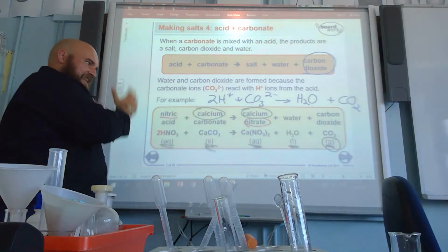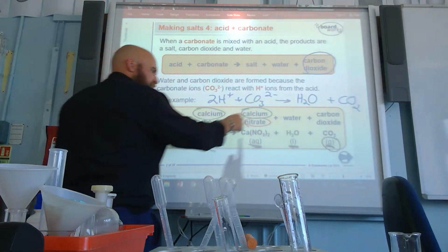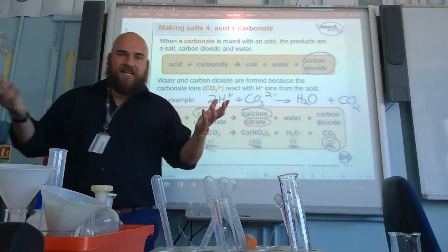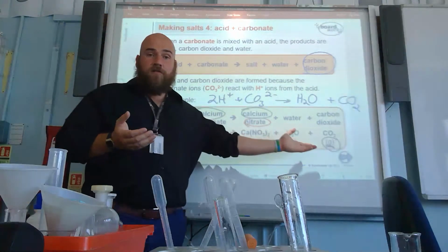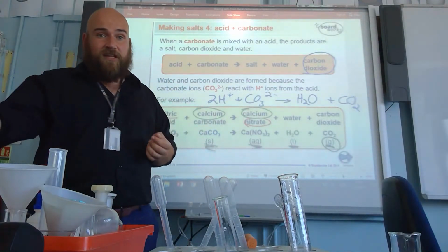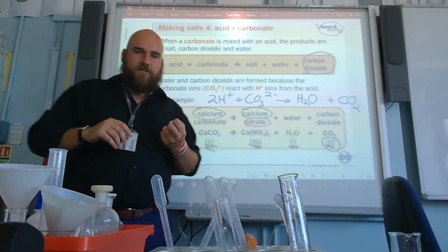Well, look, compare left to right. Right? There was a solid at the start, but there isn't at the end. So the solid has reacted, right? The solid has reacted with the acid and is no longer there. So the solid is no longer there at the end. So there's 2 observations there. You're going to see a solid, all right, slowly disappear, and you're going to see a gas produced, all right?